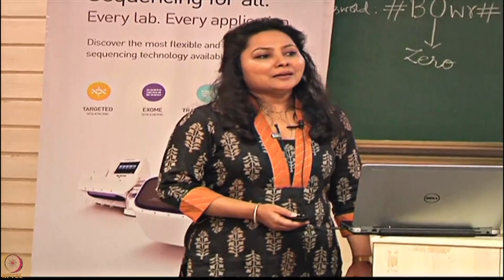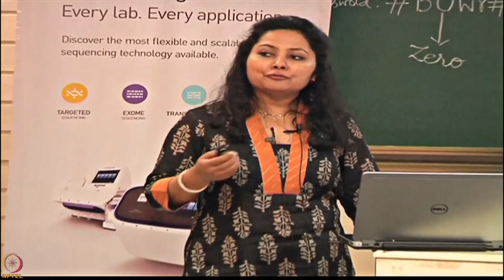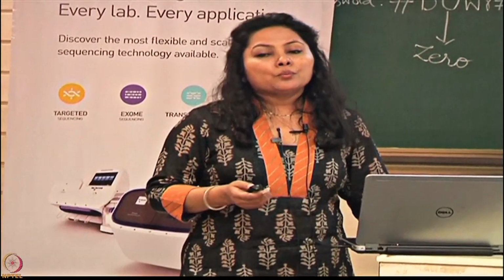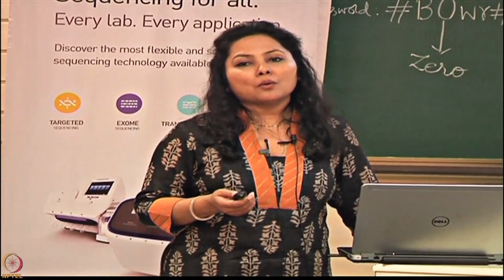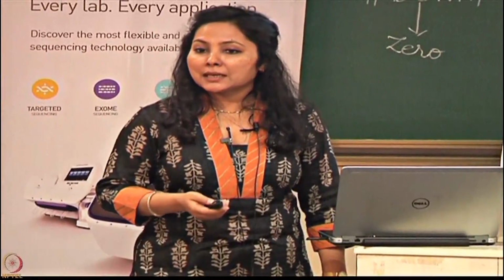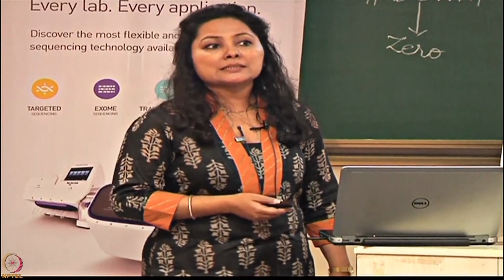I am Atima Agarwal from Thermo Fisher. I have been with this company for many years now. If you remember or have heard, in the pre-1990 era, sequencing used to be done on gels with radioactive labels. It used to be a very cumbersome affair, but it contributed a lot to the science, in the sense that the first human genome was sequenced on these systems.